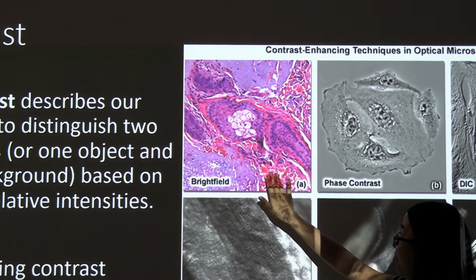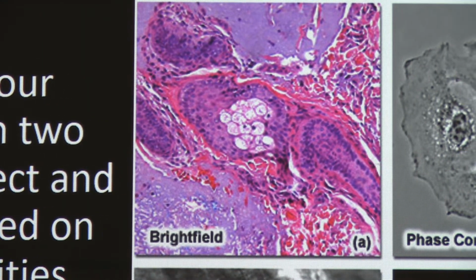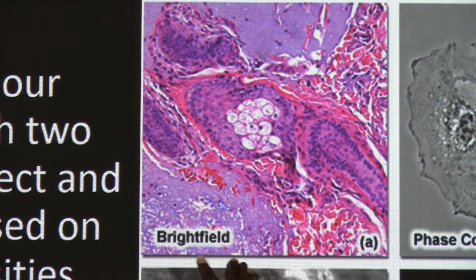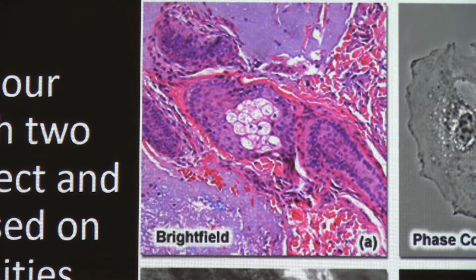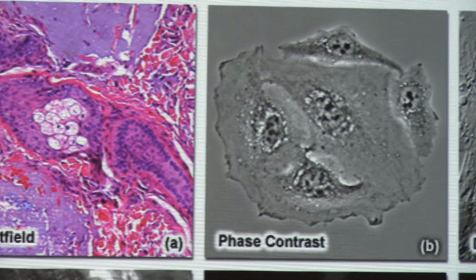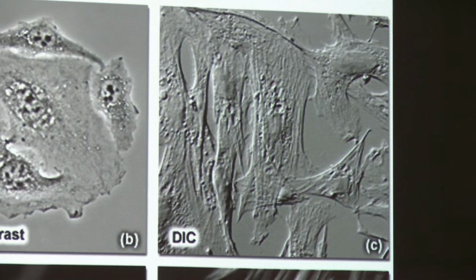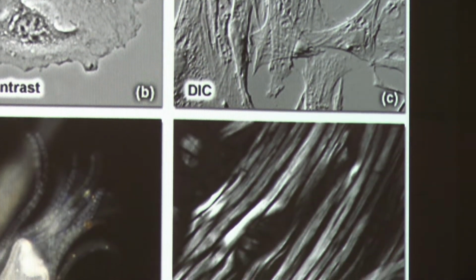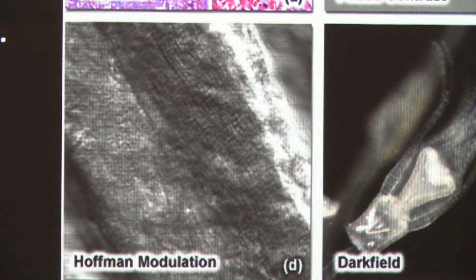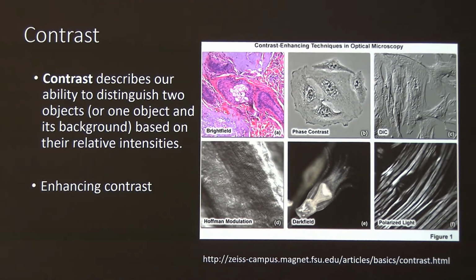So as you see here, after staining, because the sample will have these different colors, and also the color shows in different structure, it could be seen or recognized with the bright field microscope. And also there's other methods that could increase the contrast. So for each method or technology, it leads to one type of light microscope. So in this section, we will see the phase contrast microscope.